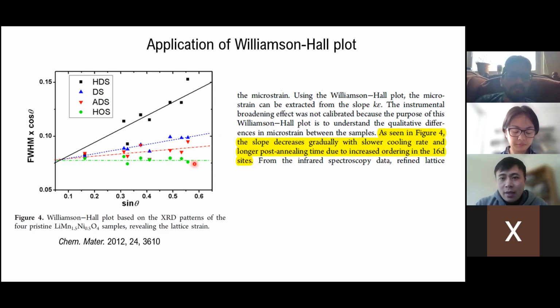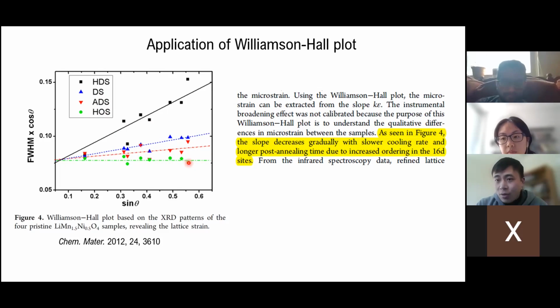And in fact, this also relates to the crystal structure. You will see that in this so-called highly ordered spinel, the nickel 2+ and manganese 4+ start to form a sort of ordering. And that would lower the global symmetry of the crystal. And in this case, there's no ordering between the nickel and the manganese.